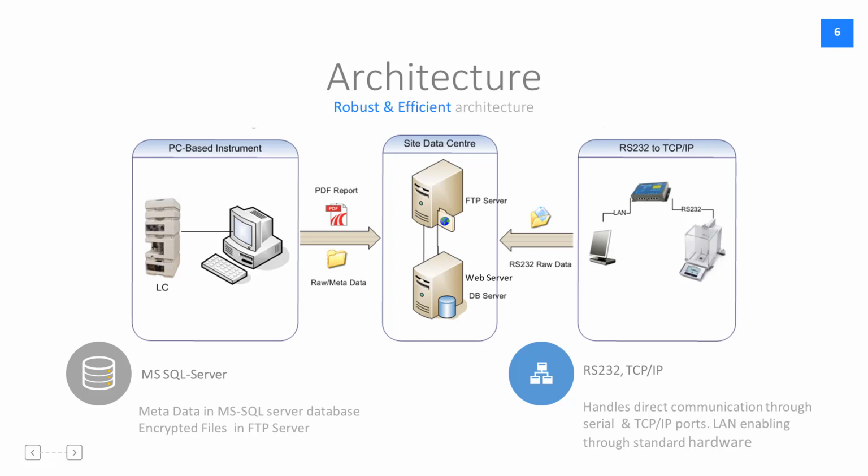The data from such standalone instruments are captured and stored as individual files in the central FTP repository. The metadata related to the instrument data, like which user collected the data, which instrument generated data, is also stored in the SQL Server database.